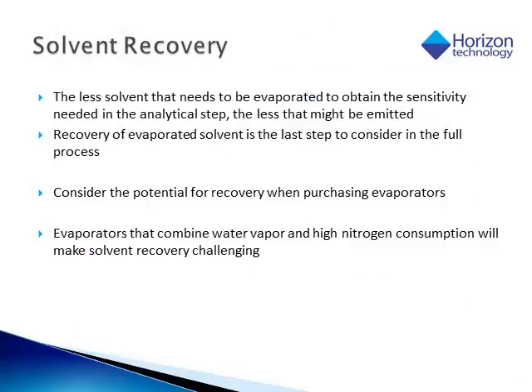With regards to solvent recovery, the less solvent that needs to be evaporated to obtain the sensitivity needed in the analytical step, the less that might be emitted. Recovery of evaporated solvent is the last step to consider in the full process. Consider the potential for recovery when purchasing evaporators. Evaporators that combine water vapor and high nitrogen consumption will make solvent recovery challenging.